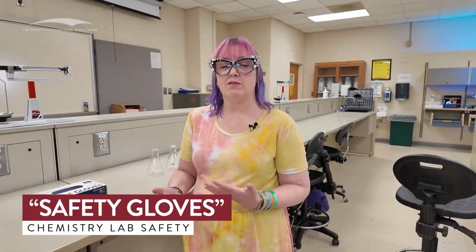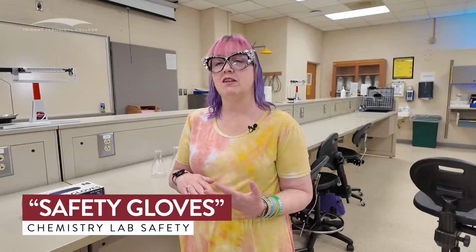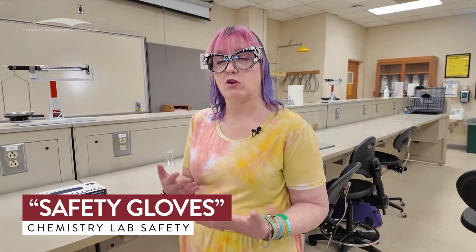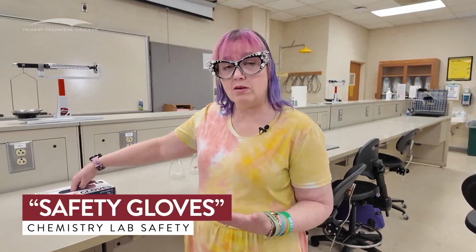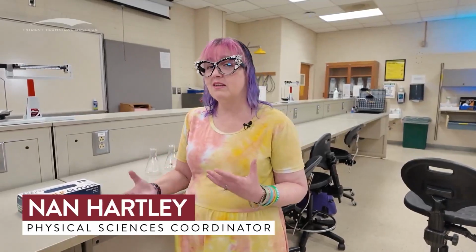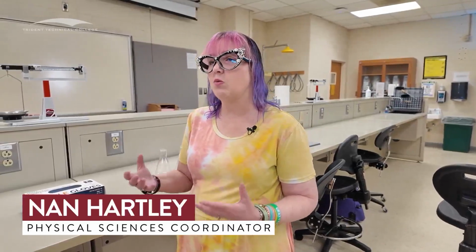We've got a couple of experiments where we specifically need to be worried about our glove protocols. Those experiments are the solution concentration, the titration standardization, and the titration for the vinegar concentration. For those experiments, it's absolutely necessary that we wear gloves for the entire experiment. For the other experiments, gloves are recommended, but not necessary. It's never that we don't want you to wear them, but you don't have to wear them for the other experiments.